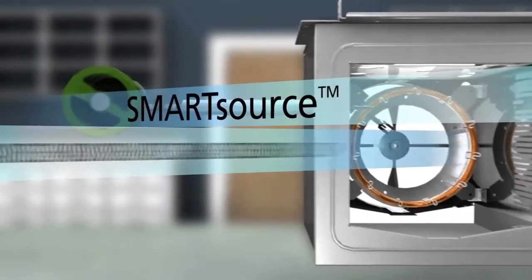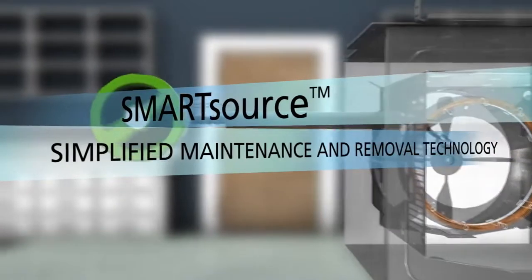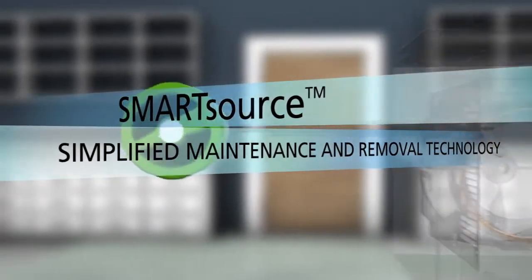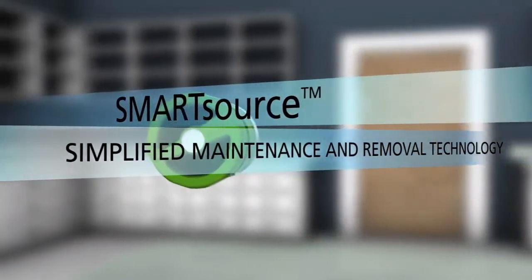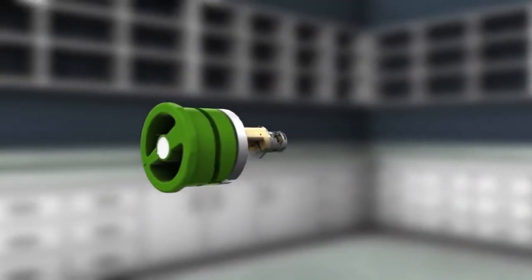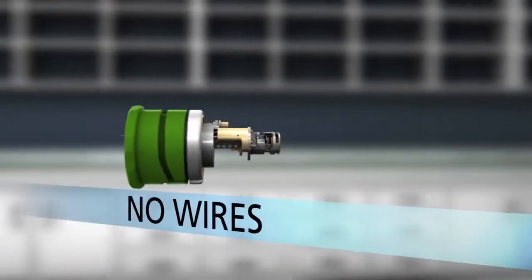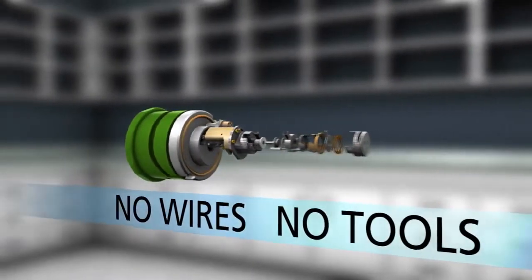A unique smart source, simplified maintenance and removal technology, can be quickly and easily accessed with a twist and pull. No wires to disconnect, no tools required.